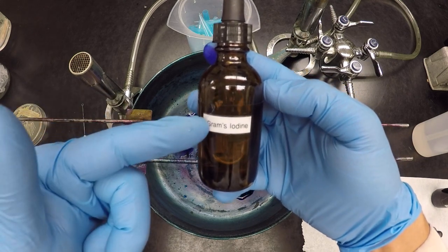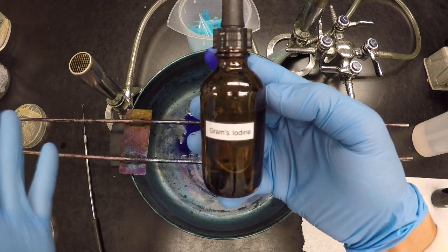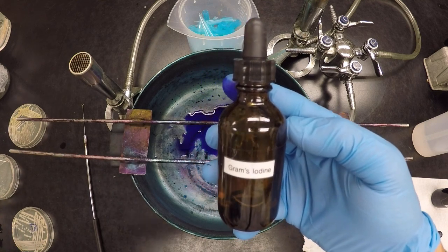In this case, what the iodine is going to do is it's going to react with the crystal violet and make it kind of big and chunky, so that it kind of gets stuck in the gram-positive cell wall. Right? It reacts with the teichoic acids, a lot of gaps that are in there.